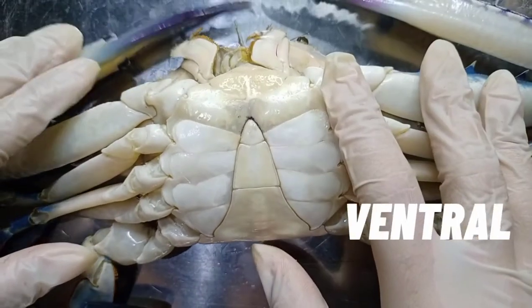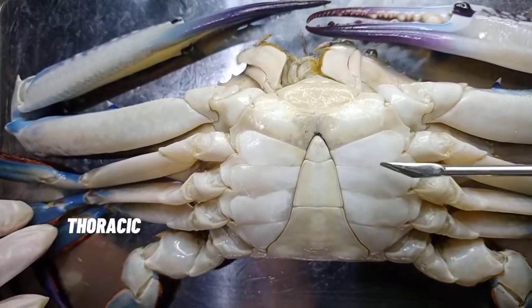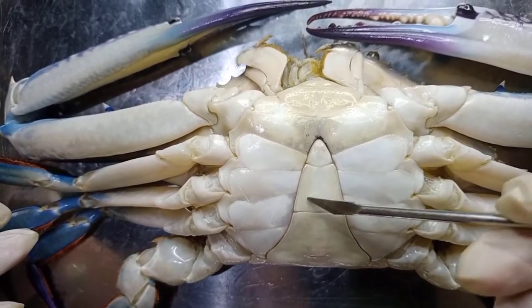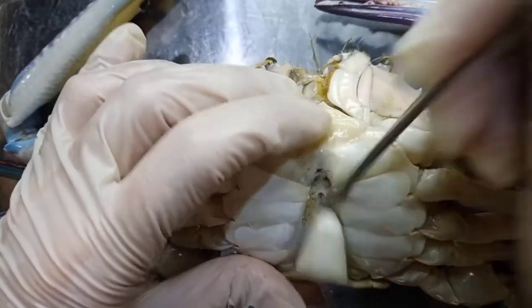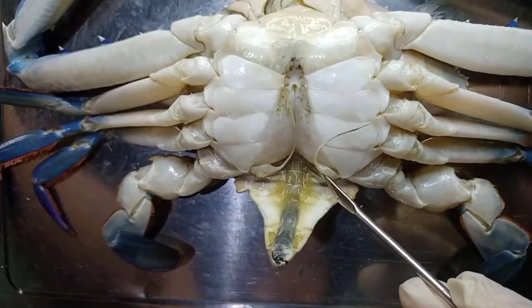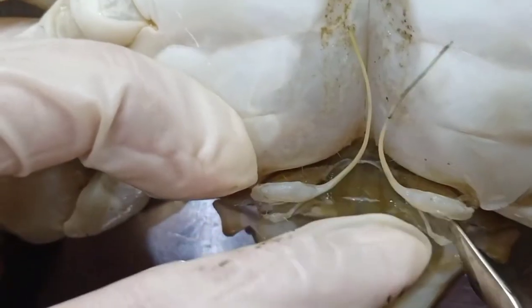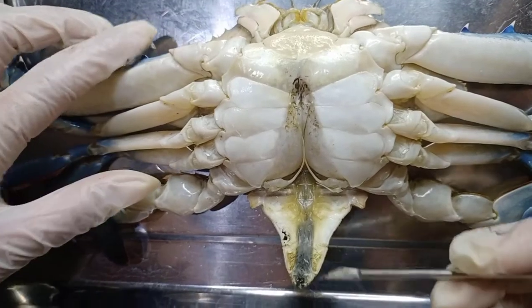Now let's flip it to see the ventral side, the part of the thorax. This is the sternum, and these are the thoracic sternites. And the apron, which is used to determine the gender of the crab — earlier we found out this is a male crab since it has a narrow apron. This part of the apron is the abdomen, and behind this we see the abdominal cavity right here. And these are the gonopods — the longer one is the first gonopod and the shorter one is the second gonopod. And this is the anus. Here is the intestine.